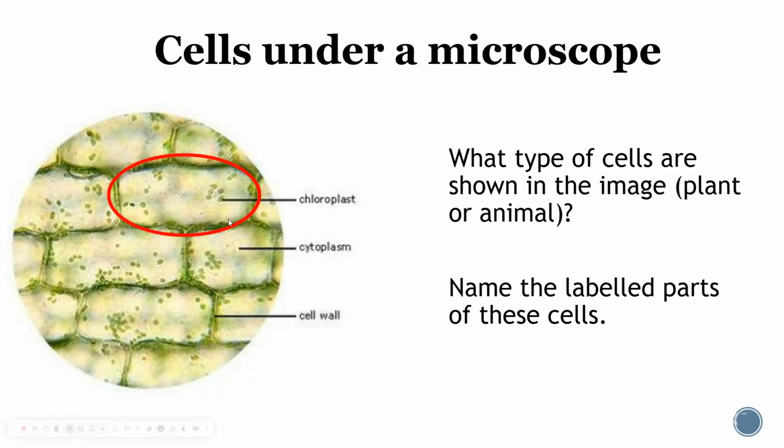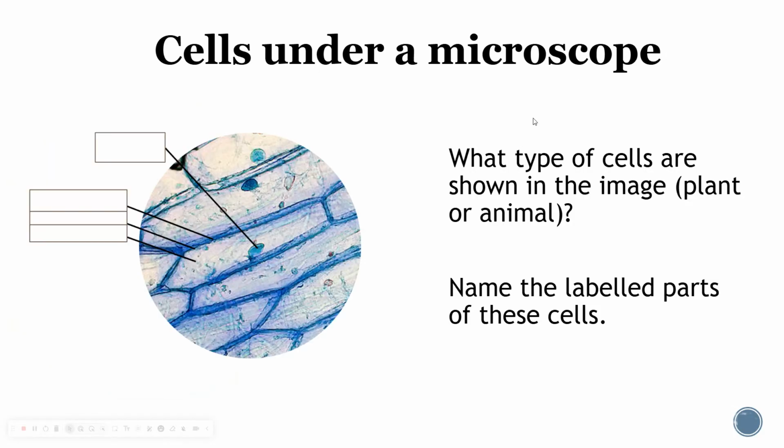And you won't see chloroplasts like this under every microscope. You really need to have powerful microscopes with good resolution and good magnification. But for now, we're just getting a taste of what some pictures could look like under the microscope. We can try this one out here. So this one you'll notice also has rectangular boxes.